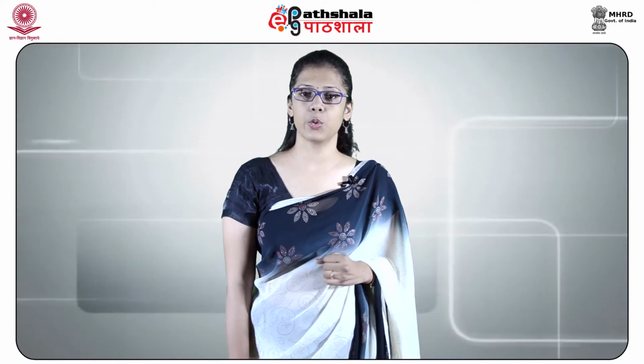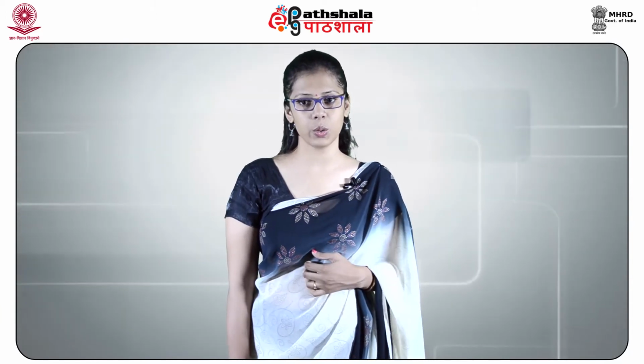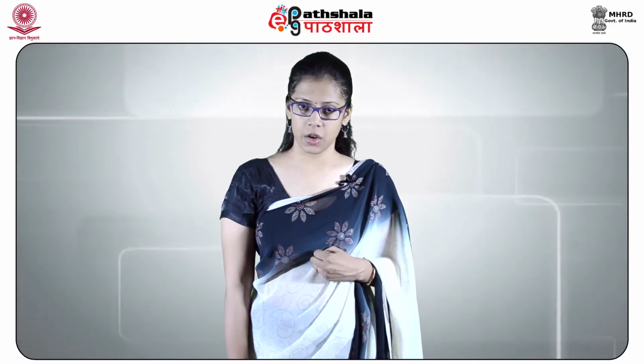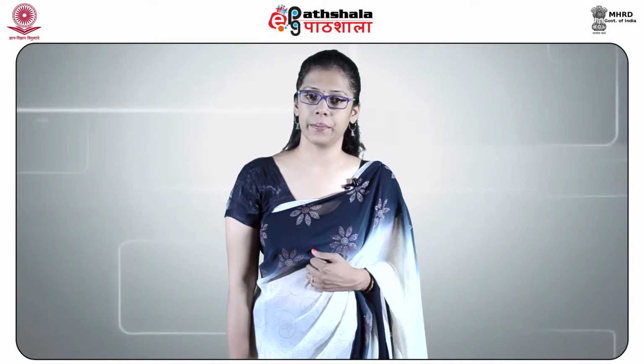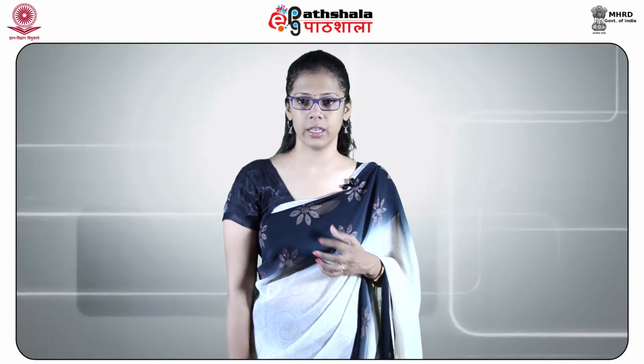Next step is to do microscopical examination. Microscopically, detection of spermatozoa is also considered as confirmatory evidence for the presence of semen in a suspected stain. In order to conduct microscopic identification, part of the stained garment should be dissolved in acidulated water in a test tube.